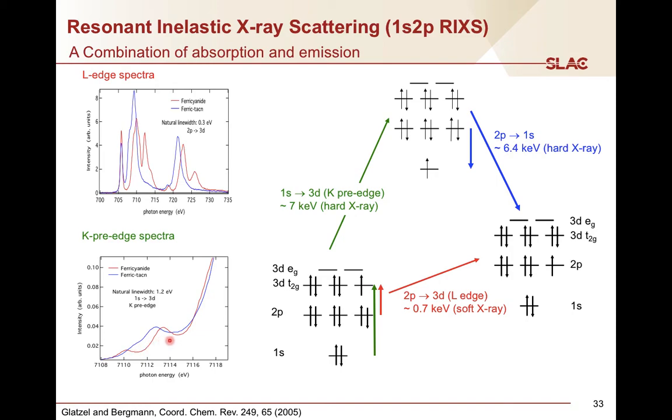Very broad, hardly to see anything, particularly compared to this one. That is because the natural line width for iron is like 1.2 eV or so. But life isn't over yet. It still goes on. So the 1s, as we said before, wants to get filled. It's an excited state. And it gets filled, first of all, with an electron from 2p.